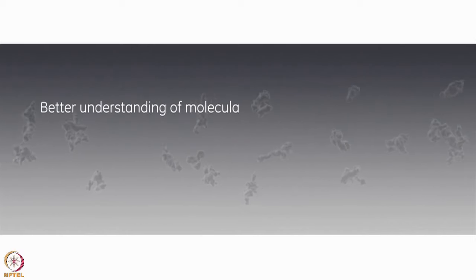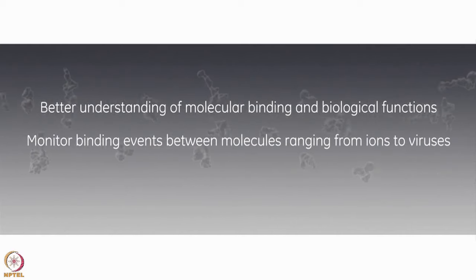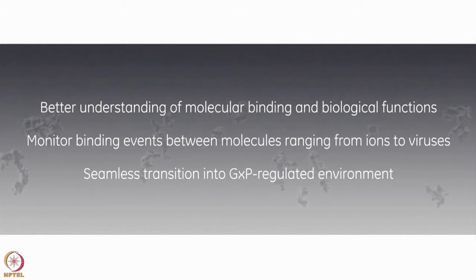This means that in a single SPR experiment, you have now obtained a wealth of information about your binding, which helps you understand the dynamics of the interaction or to quantify your analyte. And all of this without using labels.